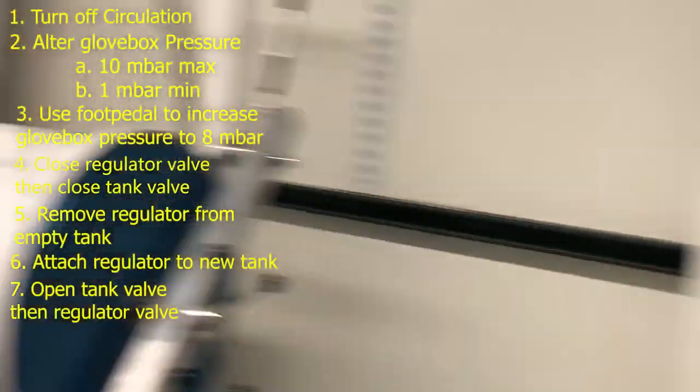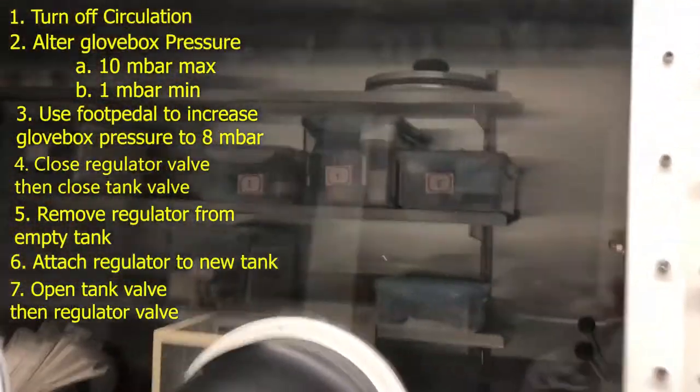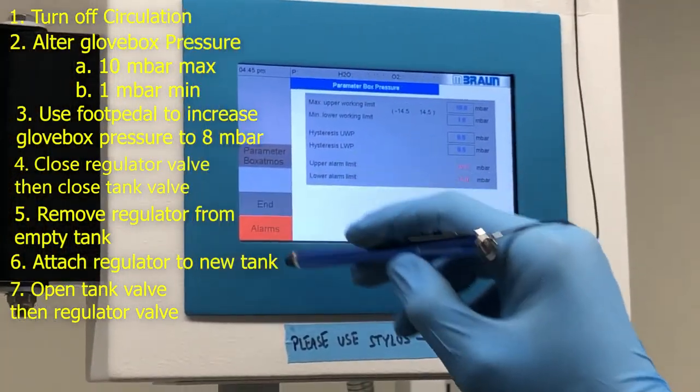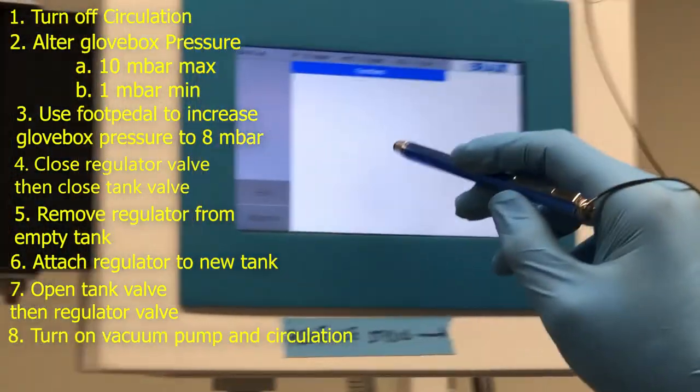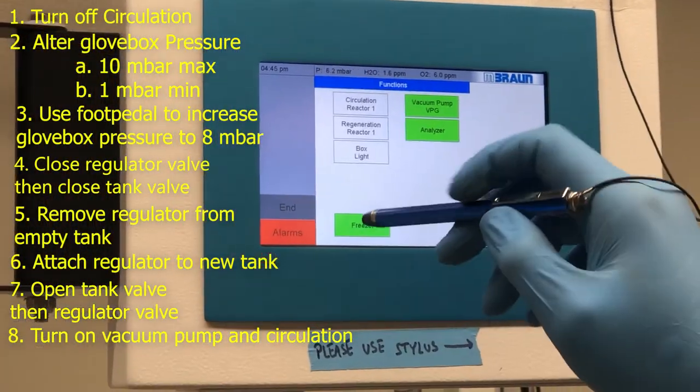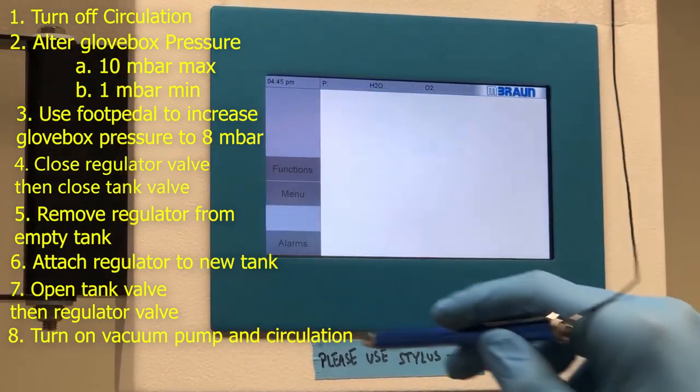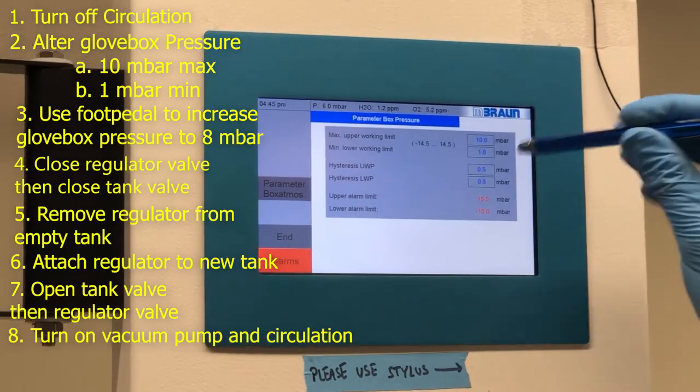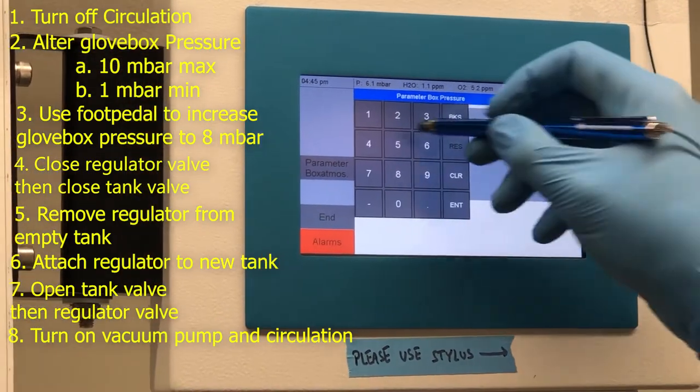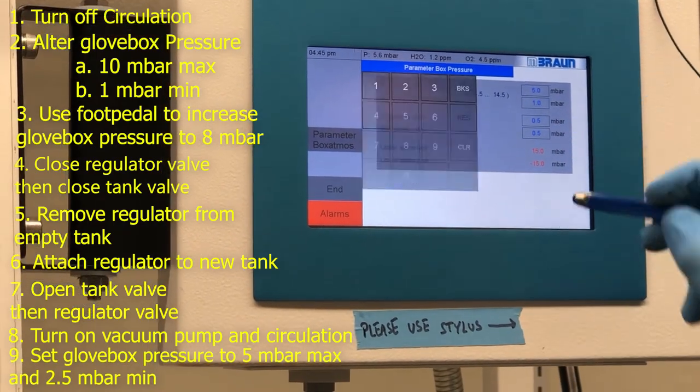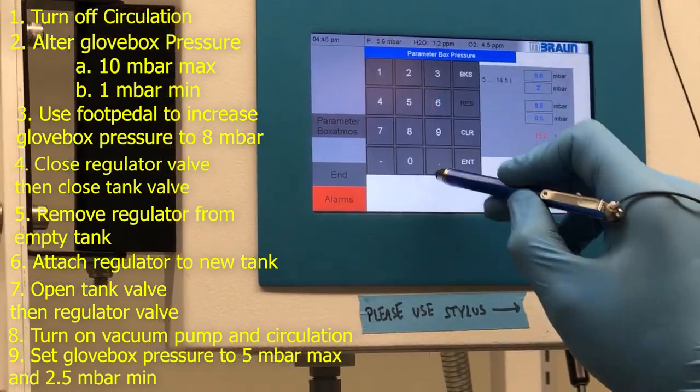Alright. Then we go back over here. And now we can, first I'm going to turn the vacuum pump on. In the functions menu. I'm going to turn circulation back on. And we're going to decrease this pressure back down to 5 and 2.5. 5 max. 2.5.